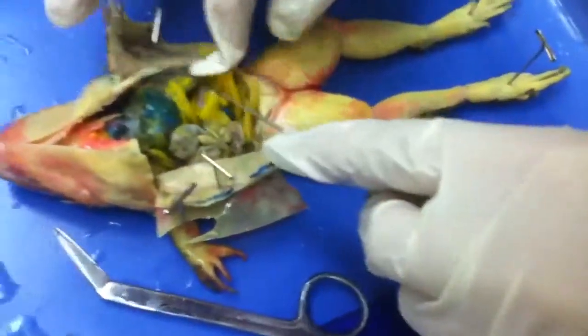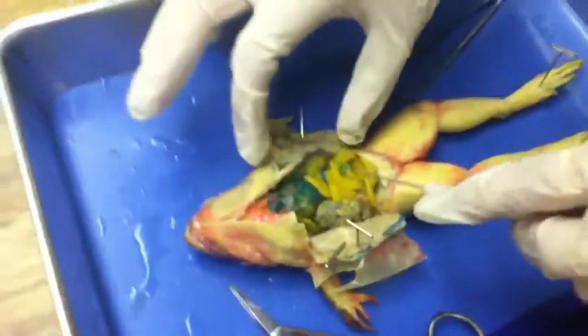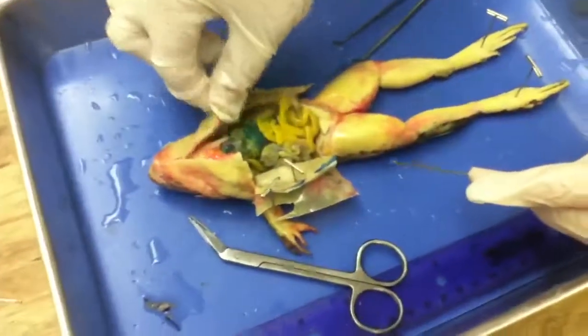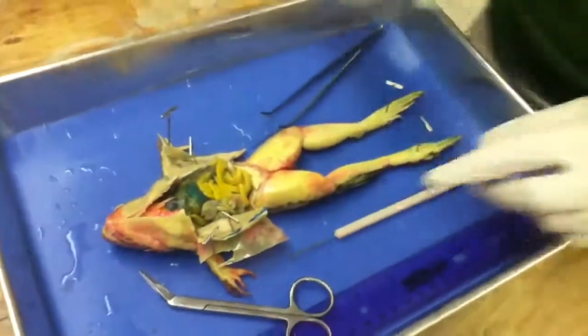Through which structures does food pass as it moves through a frog's digestive tract? Write down each structure as you find them. I bet you messed up pretty bad, frog. Oh, I just cut his sternum. Is your frog a girl? I want to see.